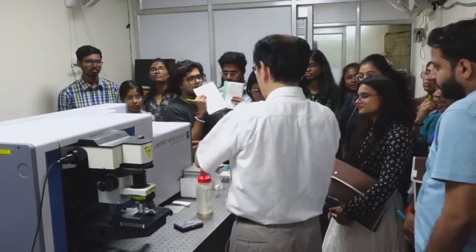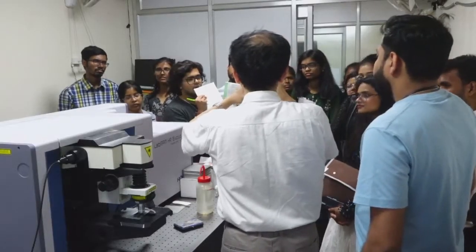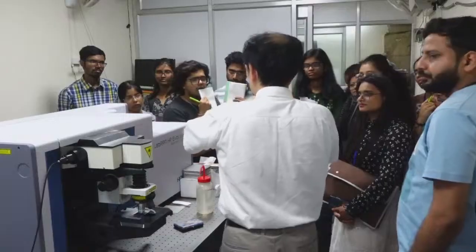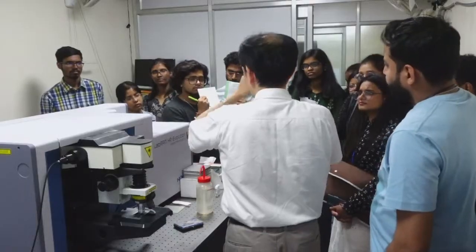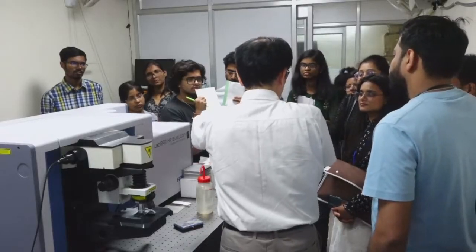The advantage of CCD is that a detector array, a two-dimensional array of detecting elements, is gathered. Instead of this, we can use a single channel detector. But in this case, only one wavelength is detected, so we need to scan next.